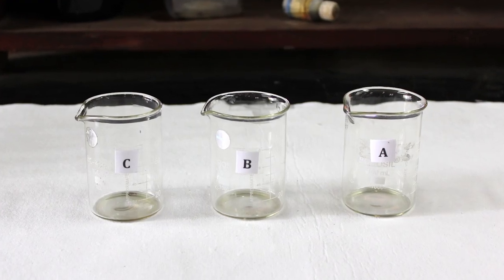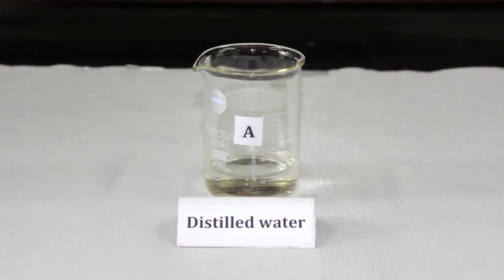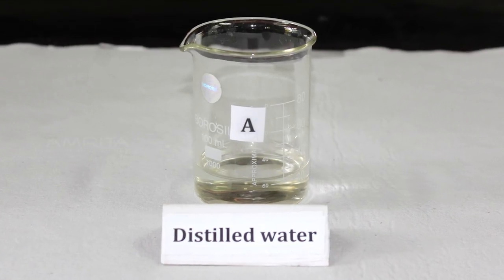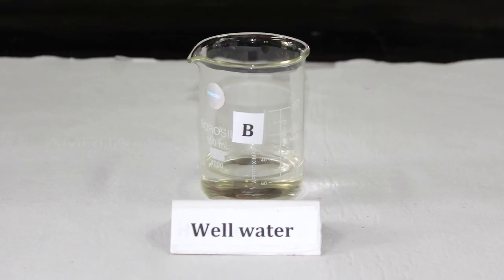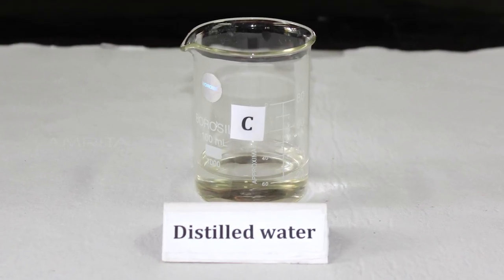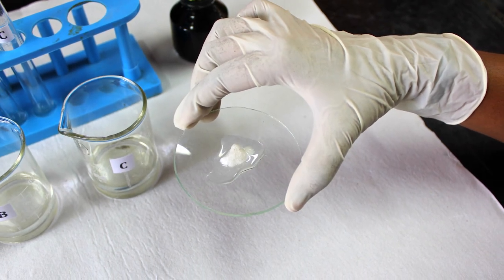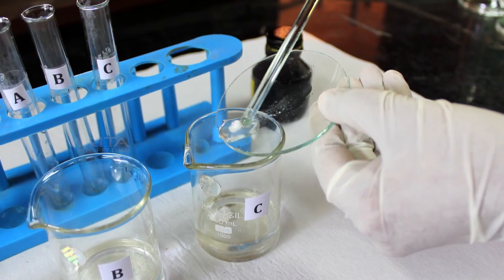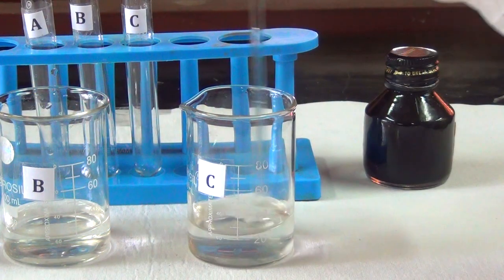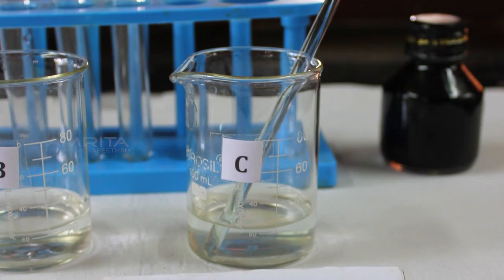Procedure: Take three beakers labelled A, B and C. Take 20 ml of distilled water in beaker A, 20 ml of well water in beaker B and 20 ml of distilled water in beaker C. Add 2 grams of calcium chloride into beaker C containing distilled water. Stir the contents of beaker with a glass rod until calcium chloride dissolves completely.